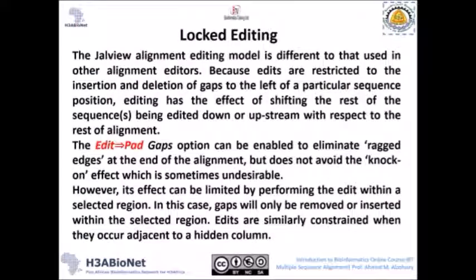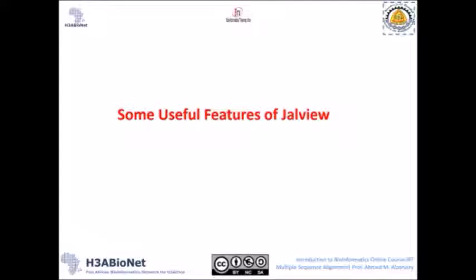Of course, locked editing is another thing you can do. This is a very good option if you don't want to change the alignment, and you want to do different things without changing the alignment. This is called locked editing. This is very useful. You can of course reach this from the edit menu.